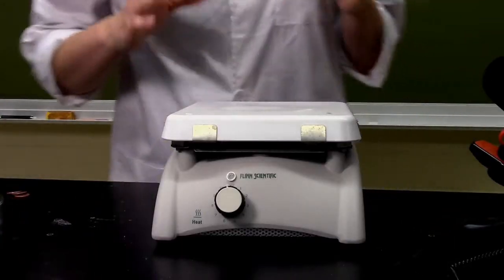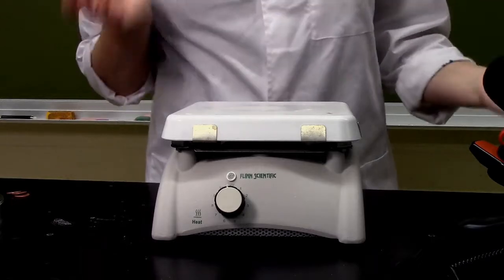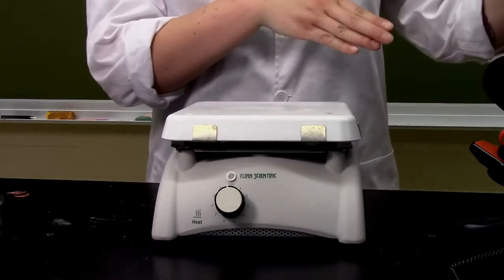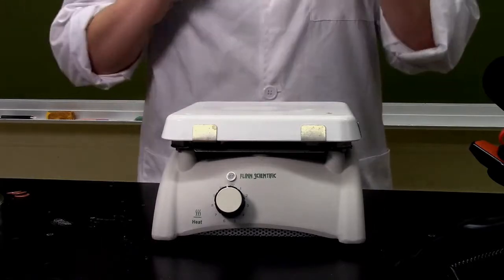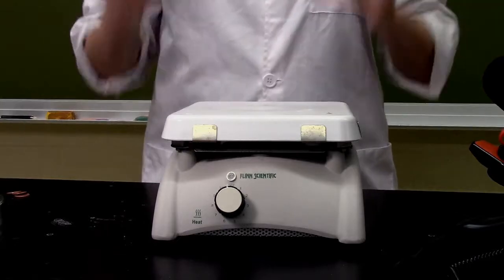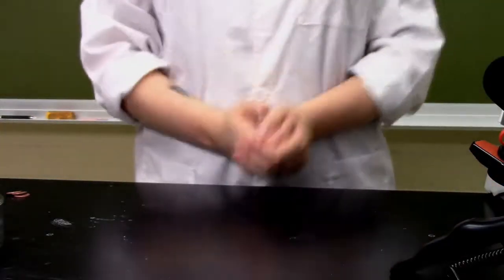Before I show y'all the pennies that I washed and dried off screen, because I felt like y'all didn't want to see 10 minutes of me drying pennies, I'm going to move this hot plate out of the way. I never want a situation where I am leaning over a hot plate. That is just dangerous. So, there we go.